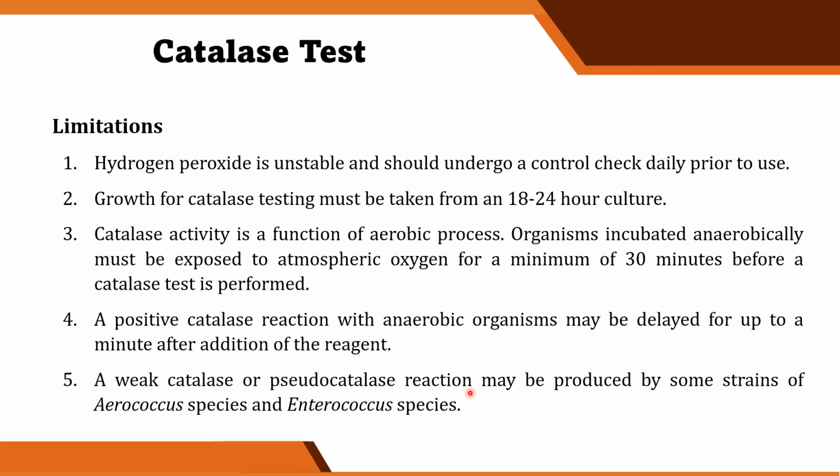Okay, and last one naman is false positive may occur if the sample is contaminated with blood agar. Okay? So, it is best if kumuha tayo ng colony for testing sa nutrient agar na lang. Or kaya sa MSA, pwede din. Wag na lang sa blood agar. Okay?